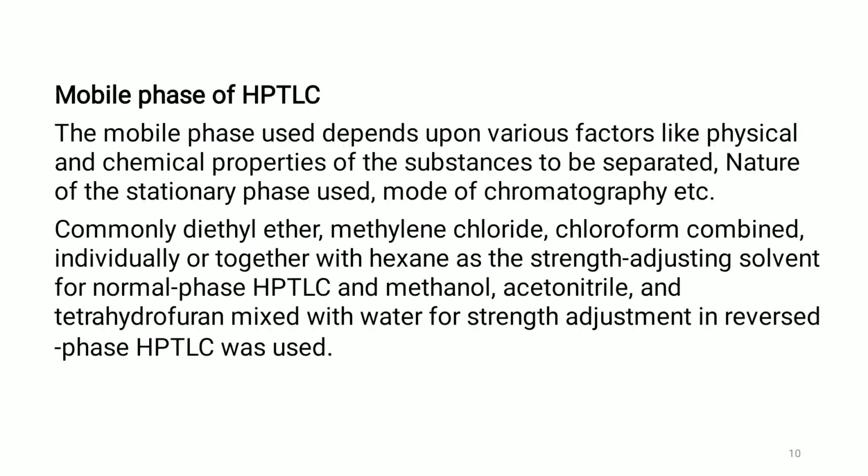Commonly diethyl ether, methylene chloride, chloroform, combined either individually or together with hexane as the strength adjusting solvent, are used for normal phase HPTLC, and methanol, acetonitrile and tetrahydrofuran mixed with water for strength adjustment are used in reverse phase HPTLC.